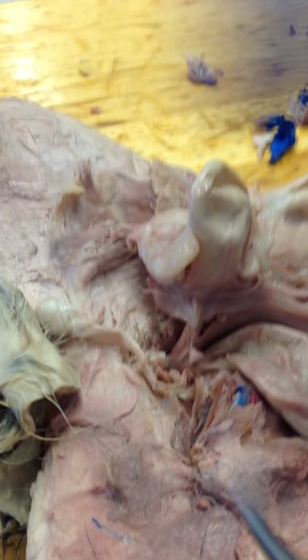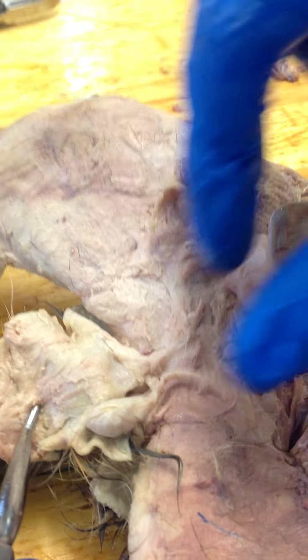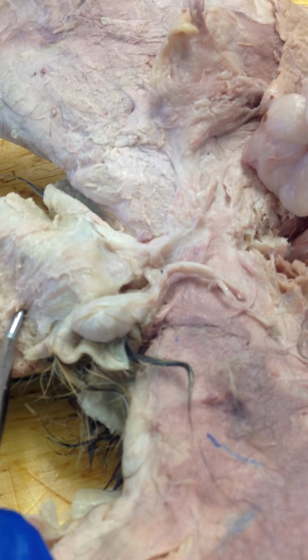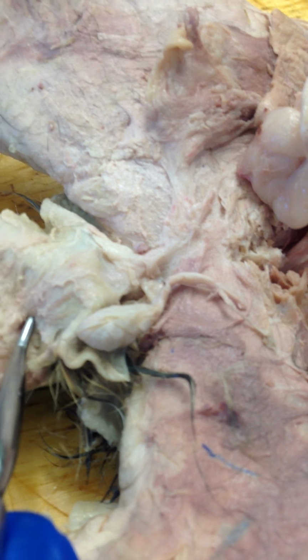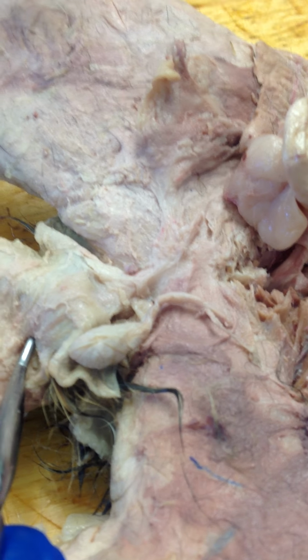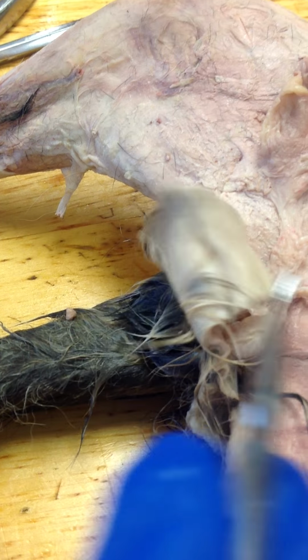Male testes. It's severed, but it was about there. So there's one of the testes. This one's still in; we didn't extract the other. Scrotum is the covering.